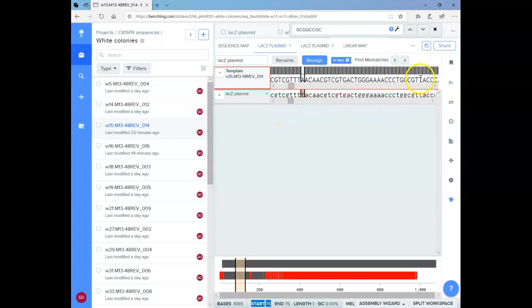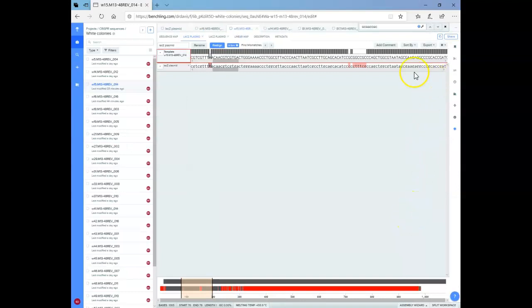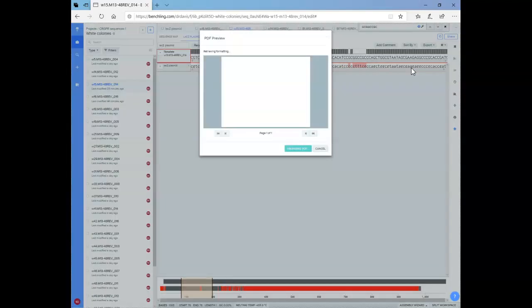Next, you want to export it. Because I have my screen sort of zoomed in so that you can see better, some of these toolbars are hidden. Let me just zoom out, see if it comes back. There it is. Okay. So if you zoom in too far, this export button disappears. So just zoom out, go to export, and then you can select PDF screen capture.